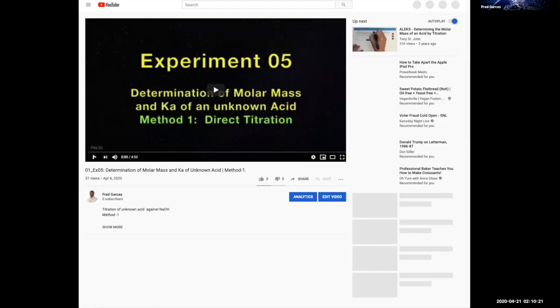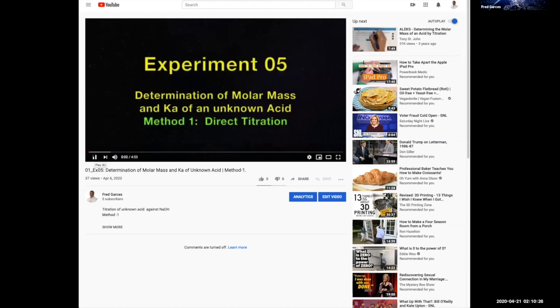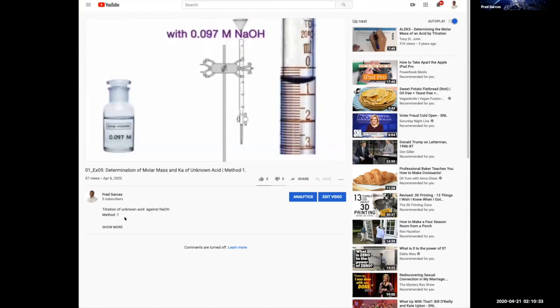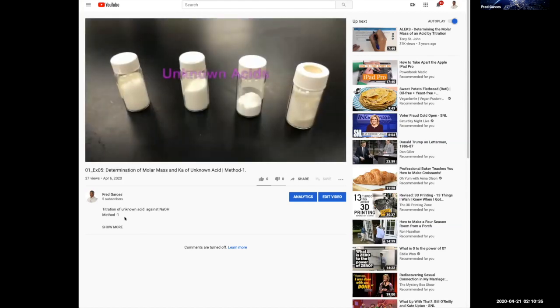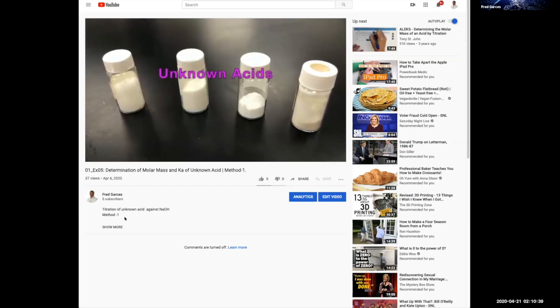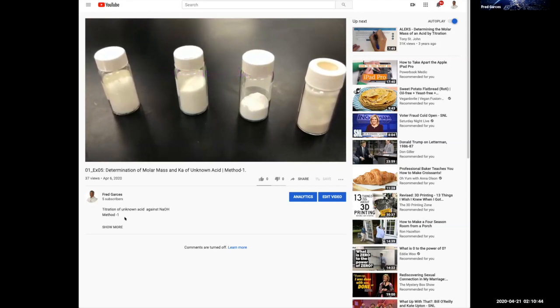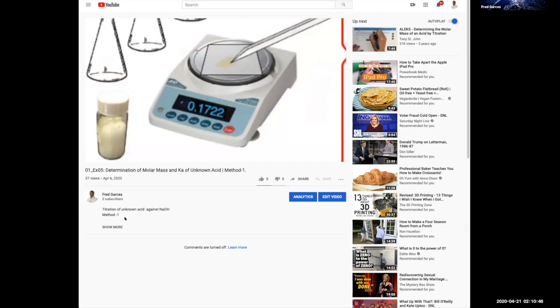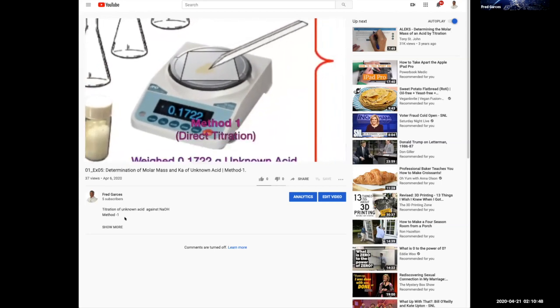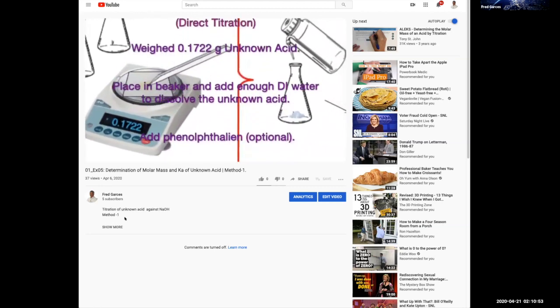Remember, this particular analysis is for lactic acid, but it would be very similar if you guys were doing your unknown. So here, rather than give you everything, because I didn't really have time, I just did an illustration and show you the steps of what's going on, which is basically a summary of pictures with the Ken Burns effect, that is, of my PowerPoint.